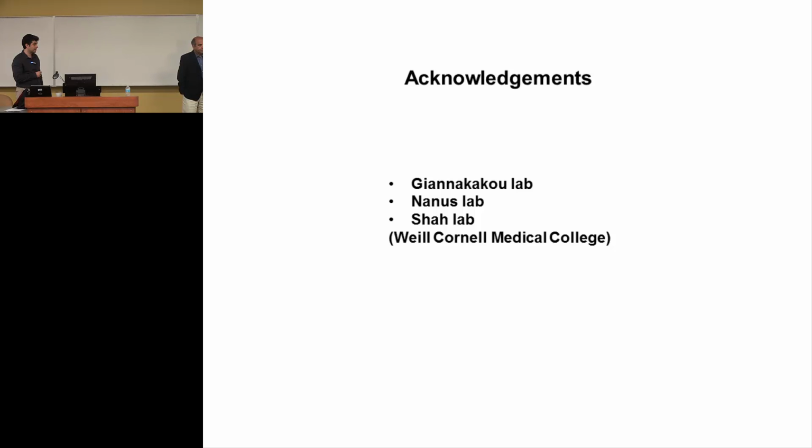Whereas in human tracking, like if... But I mean that's what the answer. He's saying that since it's so small... Yeah, that's not much. But at some point halfway through the presentation, you were extracting some morphological features. It was for another problem for the cancer cells, but you could use something similar for these cells, because even though they look very similar, there seem to be tiny differences in say size, or even just the intensity, whether they're dark or bright compared to the neighboring area.